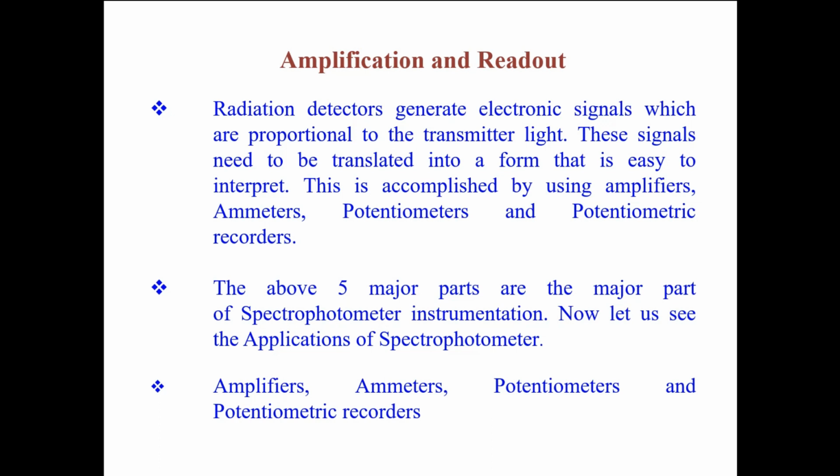First one is filters, and filters can be seen only in the colorimeters, and the colorimeters are very specific to show the bandwidth but not the specific wavelength. Okay, so there are different filters which I have shown in the previous class. There you can see there are different colors, which are essentially required for the selection of a bandwidth of a particular ray. Okay, so maximum bandwidth is like 40 nanometers. Okay, this is what we will see.